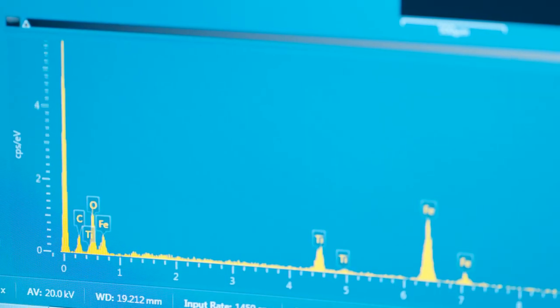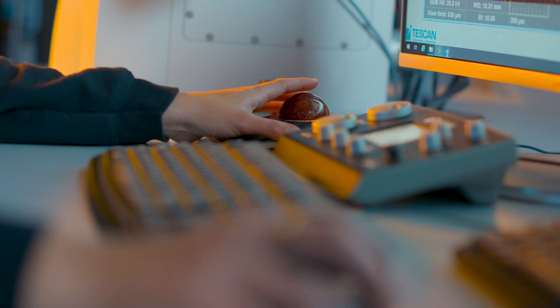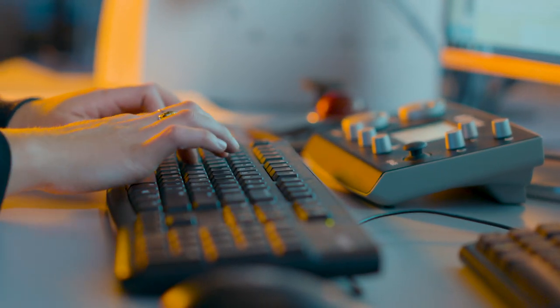We train those students, those academics, those staff to use this machine so they can use it independently to investigate their own samples.